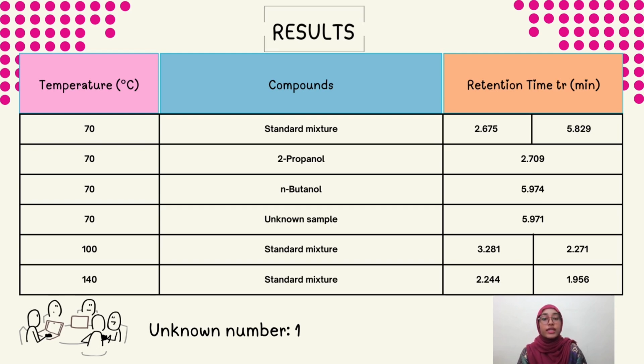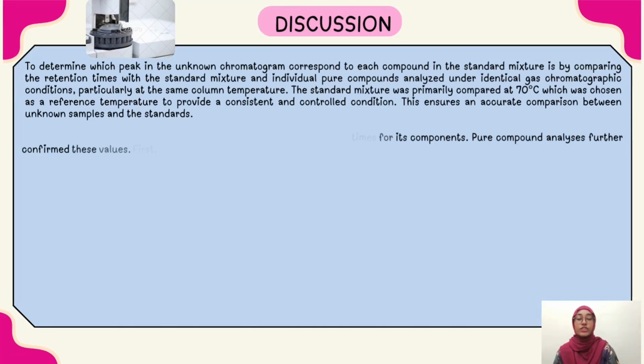Next, for standard mixture compound at 100 degrees Celsius, the retention time is 3.281 and 2.271 minutes. And lastly, for the standard mixture at 140 degrees Celsius, the retention time is 2.244 and 1.956 minutes. Now, moving on to the discussion part.